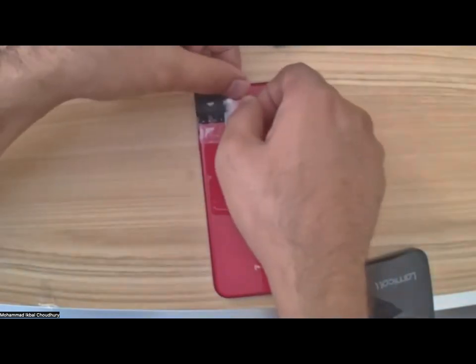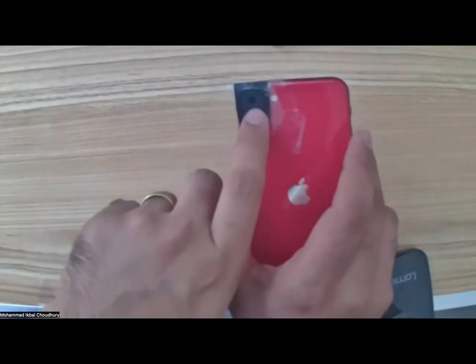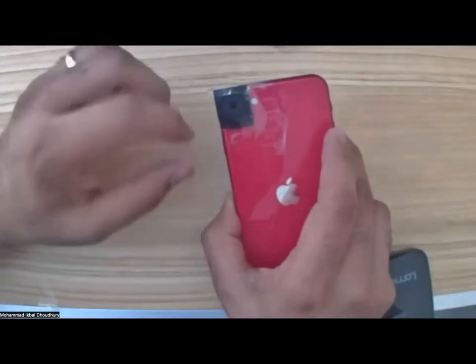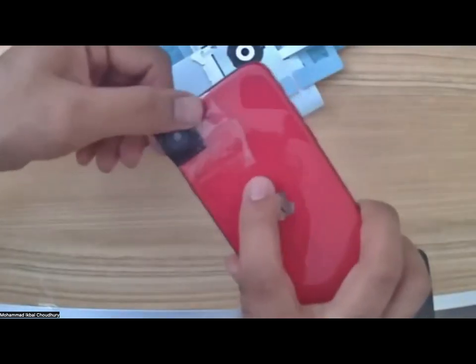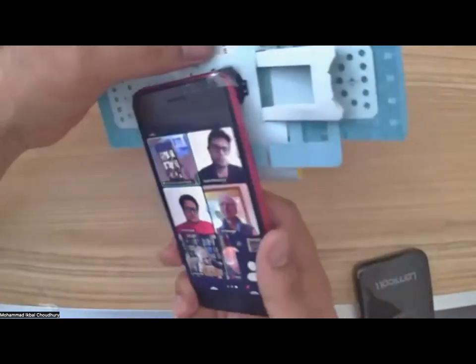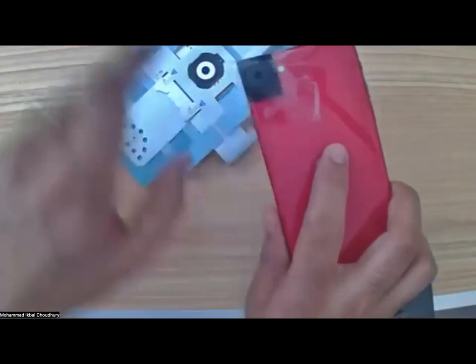So the primary problem that we are trying to address is to align the magnetic adapter right at the center of my camera. If that doesn't happen, you will not see an image at the center of your camera because it's going to shadow the field of view. Okay, so if I connect it here, see, it snaps easily. Since this is properly taped in, I can just take it closer to the foldscope and it just snaps. There's nothing to do. Once you have connected the adapter perfectly at the center, you are good to go.